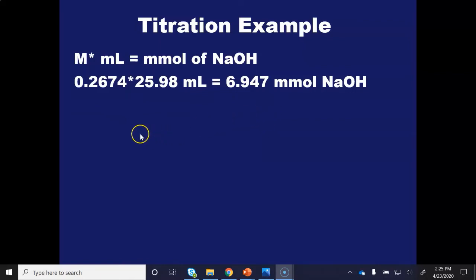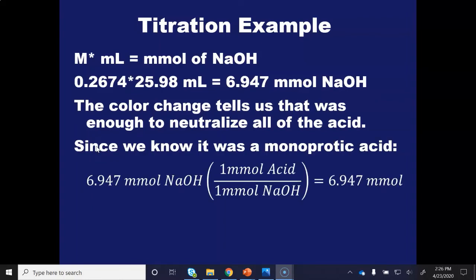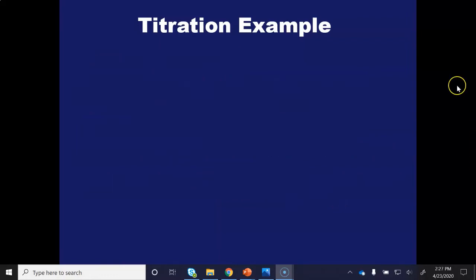Because I was at the end point, I know I added enough base to neutralize all of my monoprotic acid. I can tell that because my pH is now just a tiny bit over seven, and so the base is in a slight excess. I have a little bit of extra base. So since it's a monoprotic acid, I can say that there was one millimole of H plus acid needed for one millimole of sodium hydroxide, and I get 6.947 millimoles of acid.